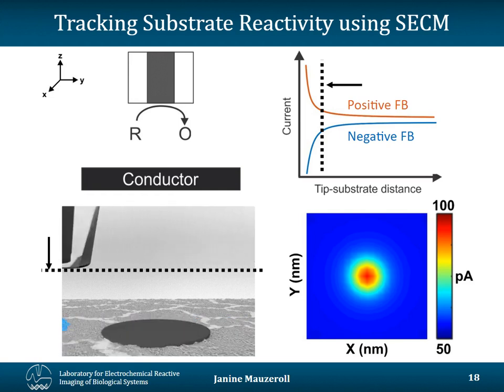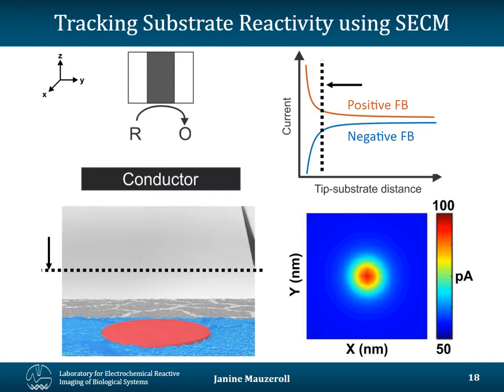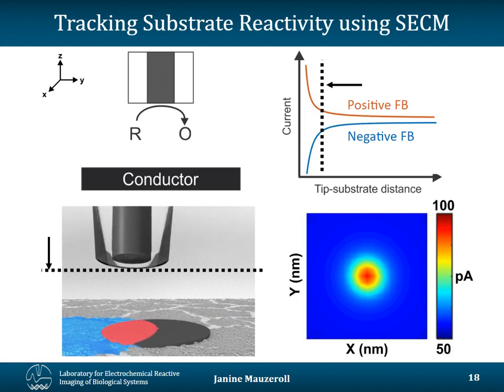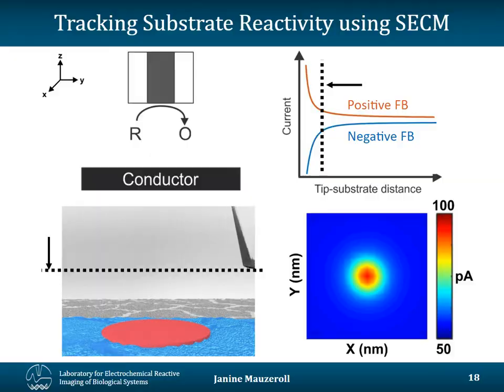So the advantage of SECM is that you can directly measure the flux, but the lateral resolution, unless you decide to combine your SECM with an AFM, which there are several groups in the world that are really good at doing this, it will be hard to have a lateral resolution with normal commercial instruments that can compete with AFM and STM.